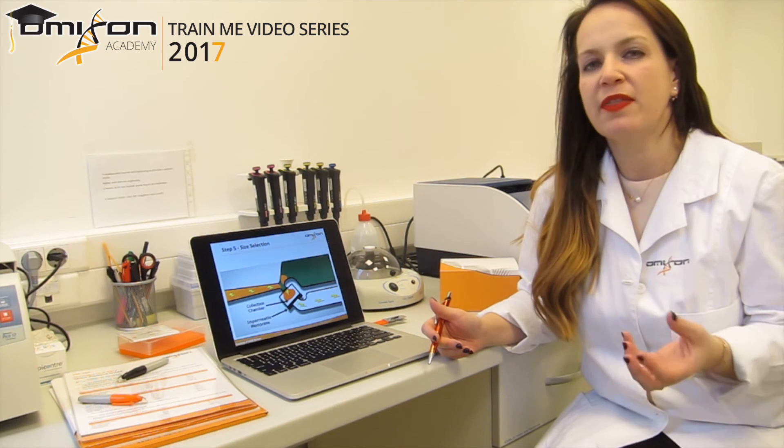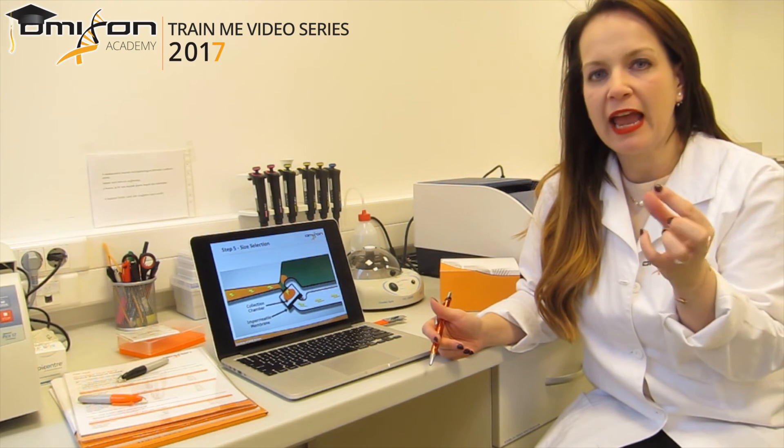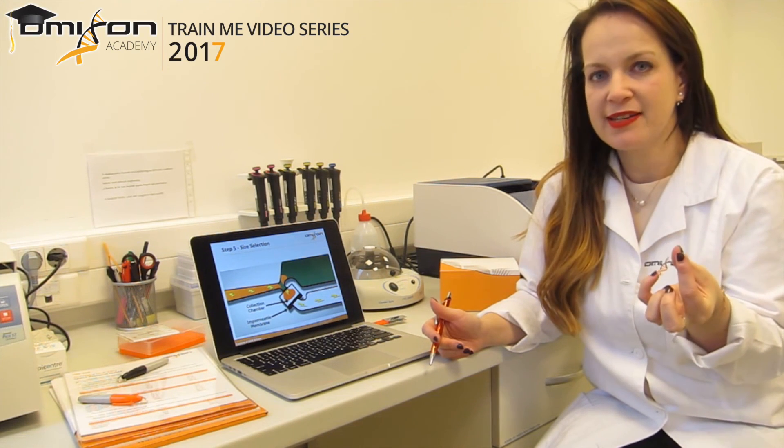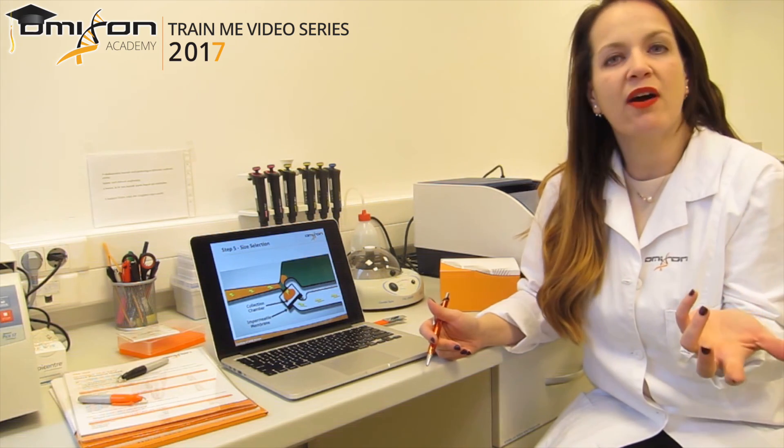Isn't it a very smart method? It's very simple, it's completely hands-off. The runtime takes about 45 minutes with the elution being approximately eight to ten minutes, and then essentially in less than one hour you have a size selected library without having done any hands-on work at all.